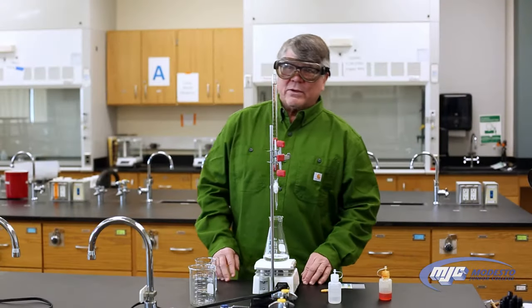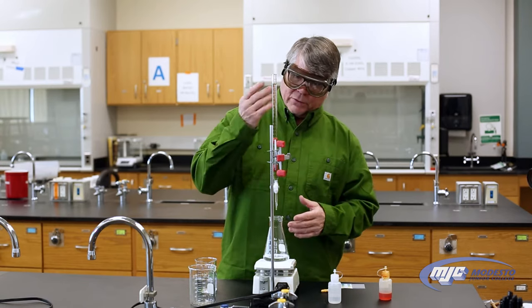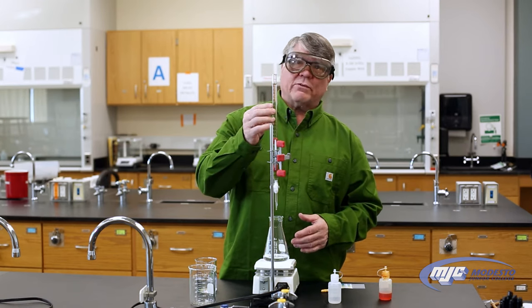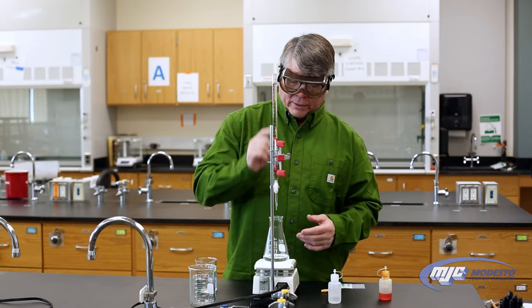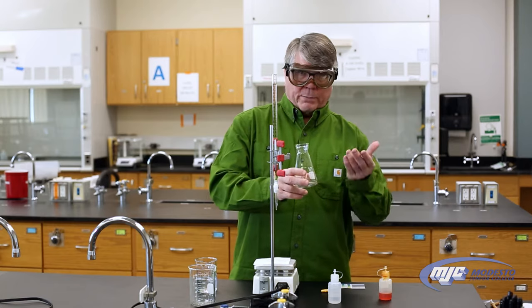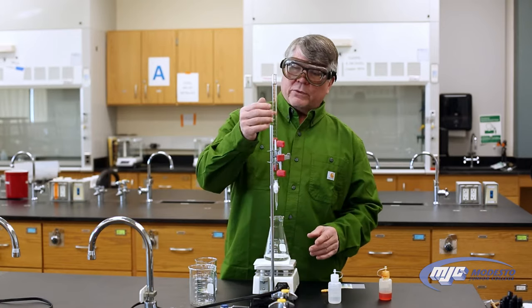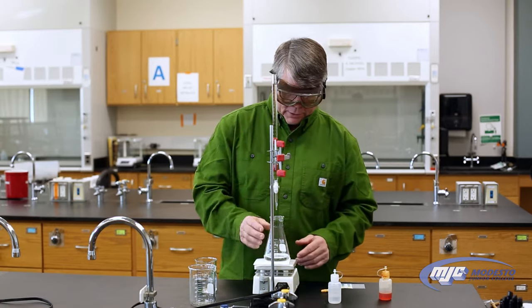Hey guys, this is an explanation of how to perform a titration. I'm going to do an acid-base titration. This is my burette — the base, the sodium hydroxide, which will be your stock solution, always goes into the burette. Down here in this Erlenmeyer flask I have an unknown acid that I'm going to titrate, meaning I'm going to react it with the sodium hydroxide until we reach the equivalence point.